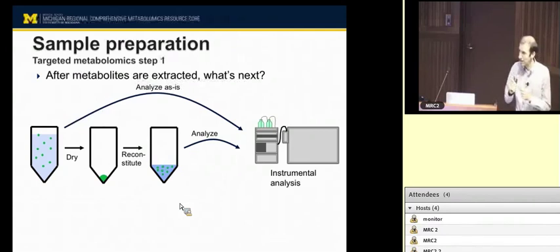Another question over here. Yeah. So what do you do if you have analytes that bind to the protein? Sure. So it turns out that this organic solvent that I was talking about helps you with that a lot. Say you have a free fatty acid, very typically in blood serum, free fatty acids are almost entirely bound to serum albumin, right? So the organic solvent actually disrupts that interaction, right?